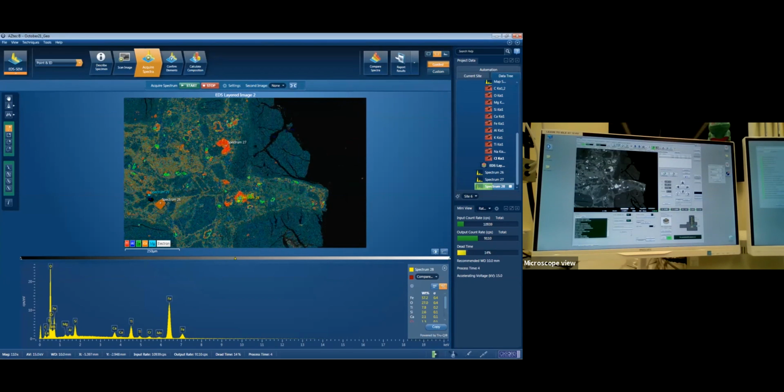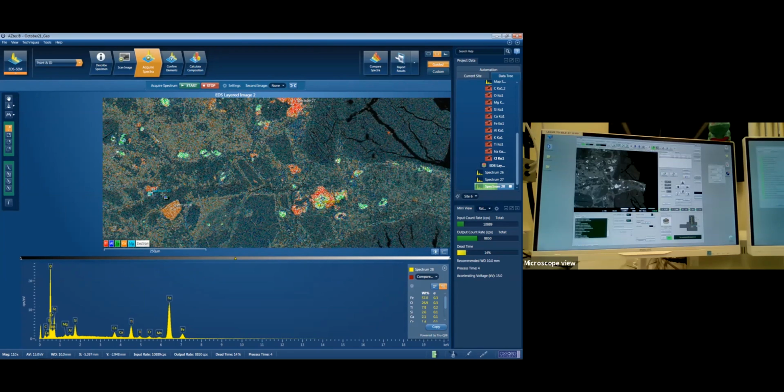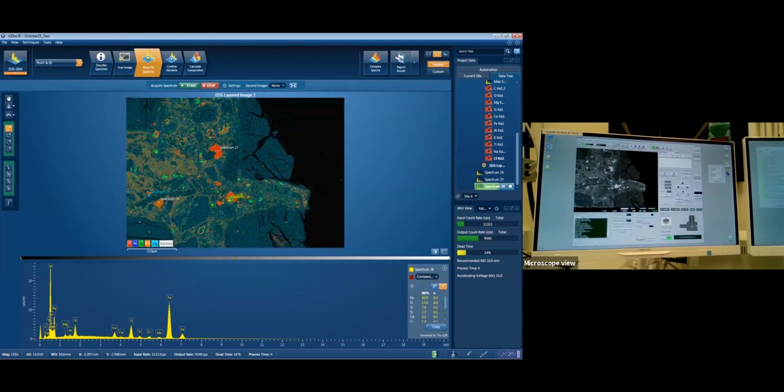And I've also found, when this one finishes, the next spectral pop-up is this little blue splodge here, which I didn't notice before, but it's a definitely different color to everything else that we're looking at. And for good measure, I'll put one in here as well, and one in there, just so we're covering all our bases.